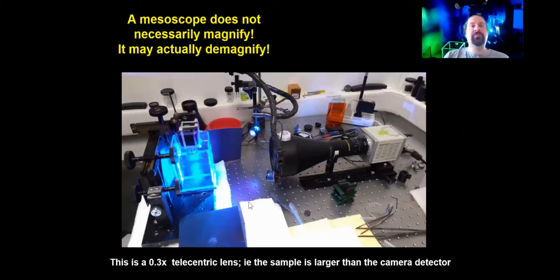Now, the other thing which I believe I failed to mention yet is that optical tomography for these very large samples relies on your ability to see through the samples. Just like with X-rays, you have to see through the sample, see what's inside, and reconstruct the anatomy from the inside. Also, with optical tomography, the samples have to be fairly transparent. Now, this is not a requisite only of optical tomography. Light sheet microscopy will also not give you details inside a sample that's not transparent enough. The same thing for confocal or even two-photon microscopy.